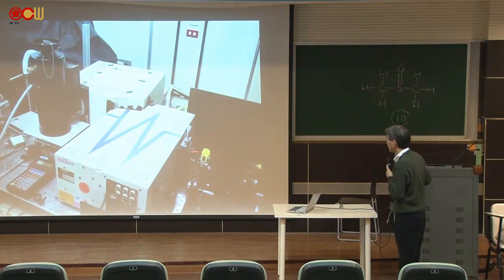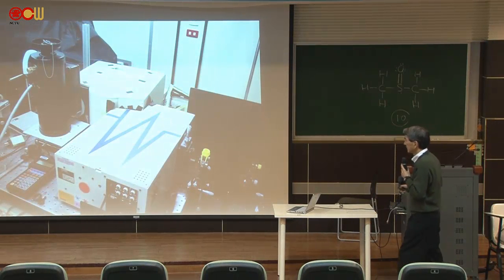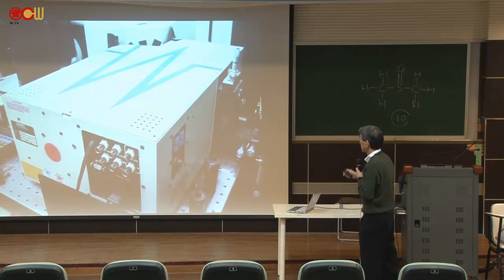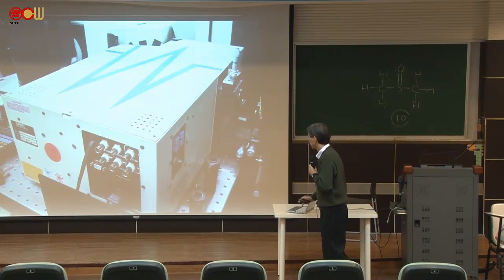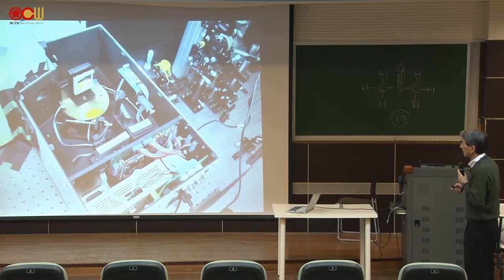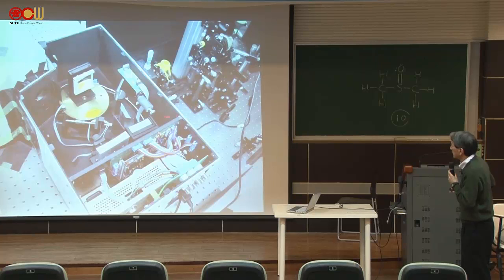And then this is a spectrometer. And if you open this one, this is the inside of the spectrometer. And here you have the entrance slit, and you have a mirror going this way and going out like that.